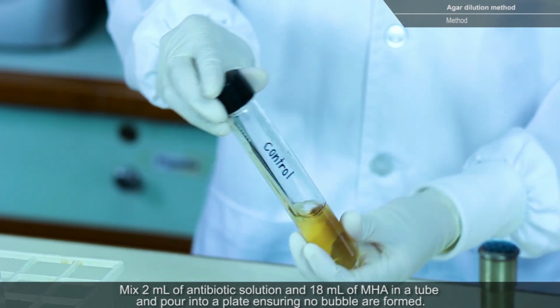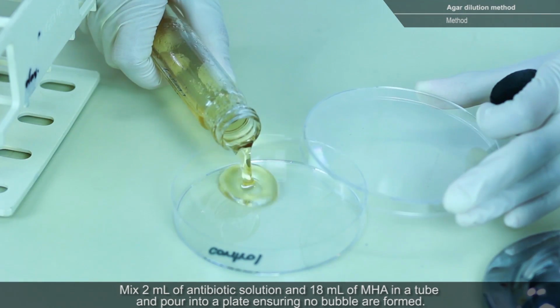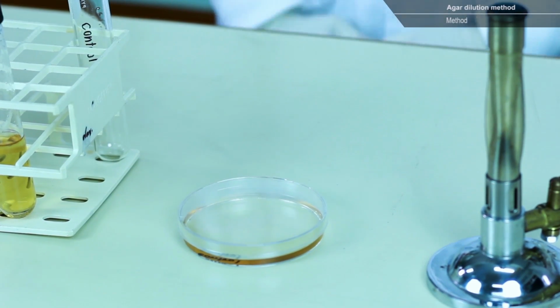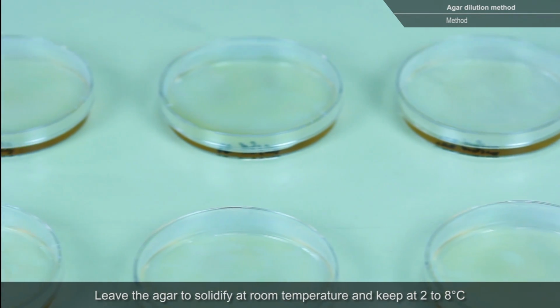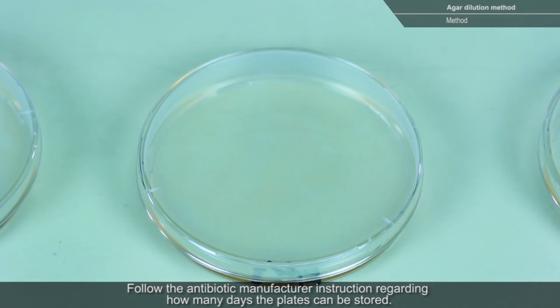Mix 2 milliliters of antibiotic solution and 18 milliliters of MHA in a tube and pour into a plate, ensuring no bubbles are formed. Leave the agar to solidify at room temperature and keep at 2 to 8 degrees Celsius. Follow the antibiotic manufacturer's instructions regarding how many days the plates can be stored.